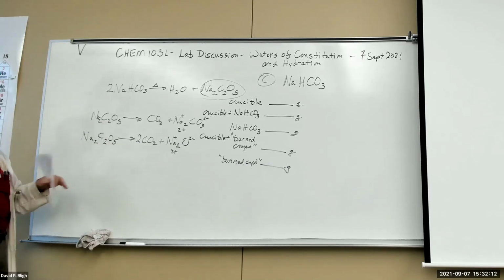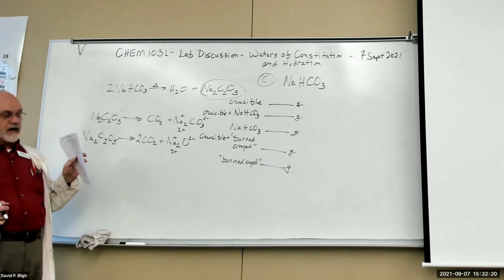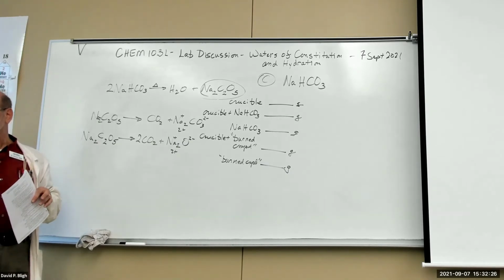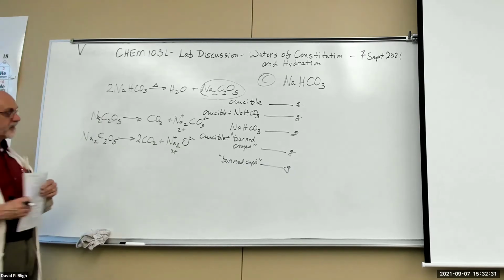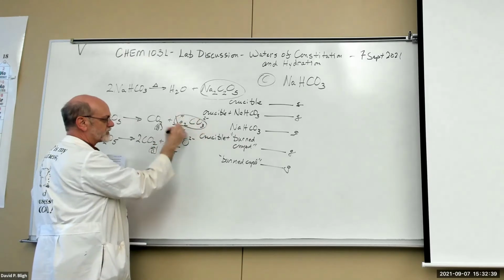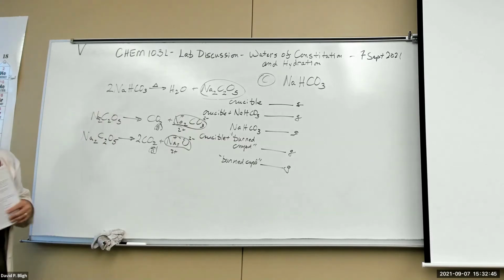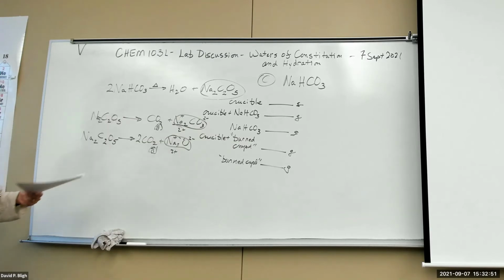Okay, so how do we tell the difference between the two? Well, there are 2 ways. There's a quantitative way, and there's a qualitative observation. And you're going to do one in the lab. It's called the fizz test. If you take the solid, if this is a gas, it's gone. The only thing you have left is this or this. So if we add 1 molar hydrochloric acid to that solid, what's going to happen?